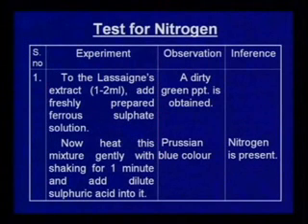Now what is the inference? From here we can't infer anything. Why? Because in this reaction no nitrogen is involved. Nitrogen is involved in the second test. So whether your compound has nitrogen or not, since this is a reaction between the ferrous sulfate and sodium hydroxide, and sodium cyanide is not involved, there is no inference.